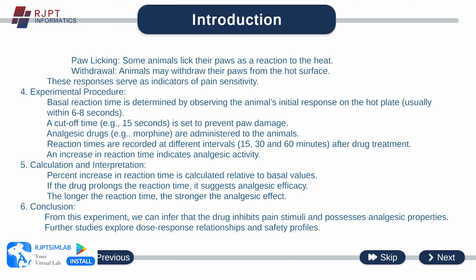Conclusion. From this experiment, we can infer that the drug inhibits pain stimuli and possesses analgesic properties. Further studies explore dose response relationships and safety profiles.